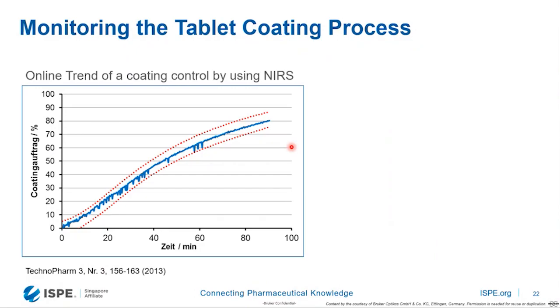Oh, I have one more slide. Here you can see that the growth of the coating should be between the upper and lower red dots, and it fits very well. Yeah, and that is all from my side.